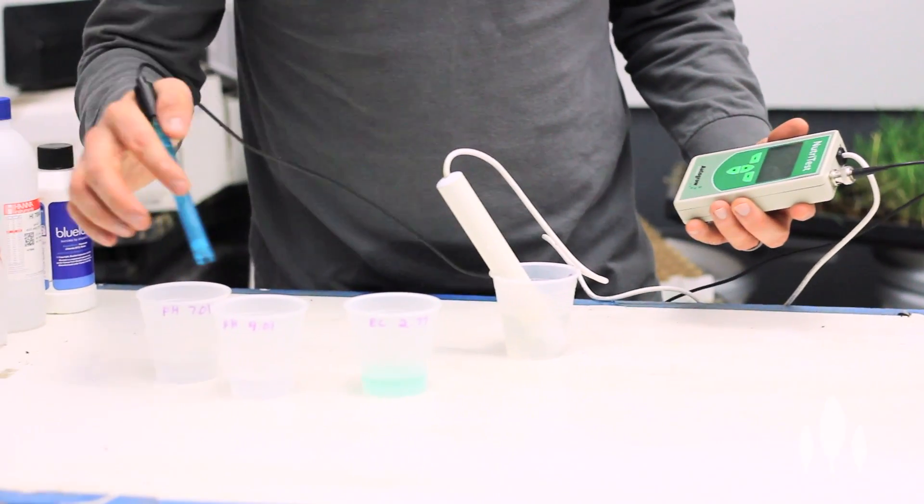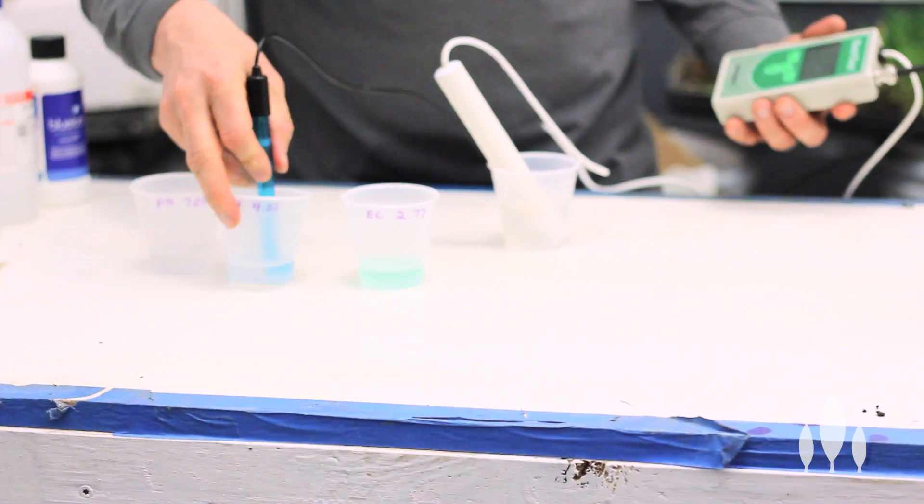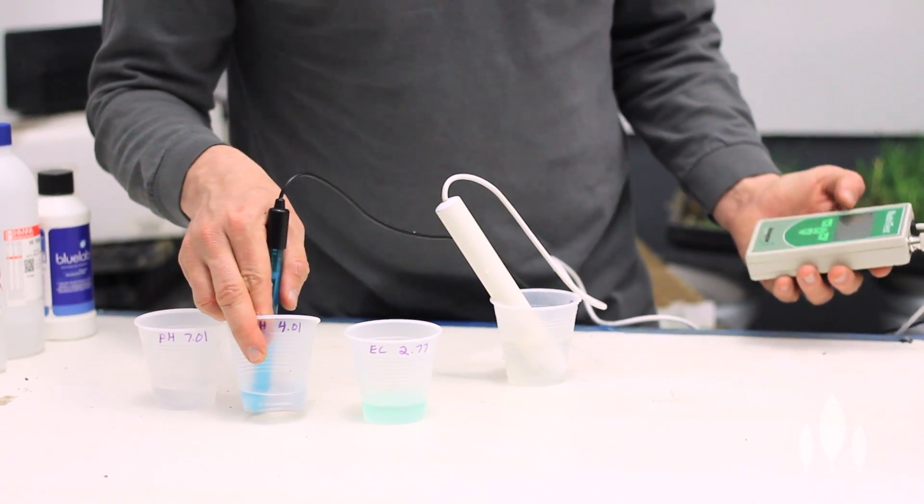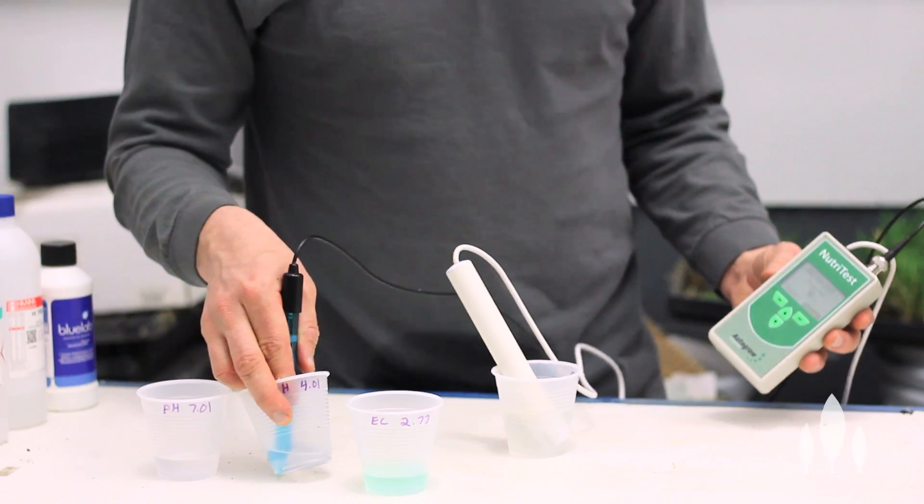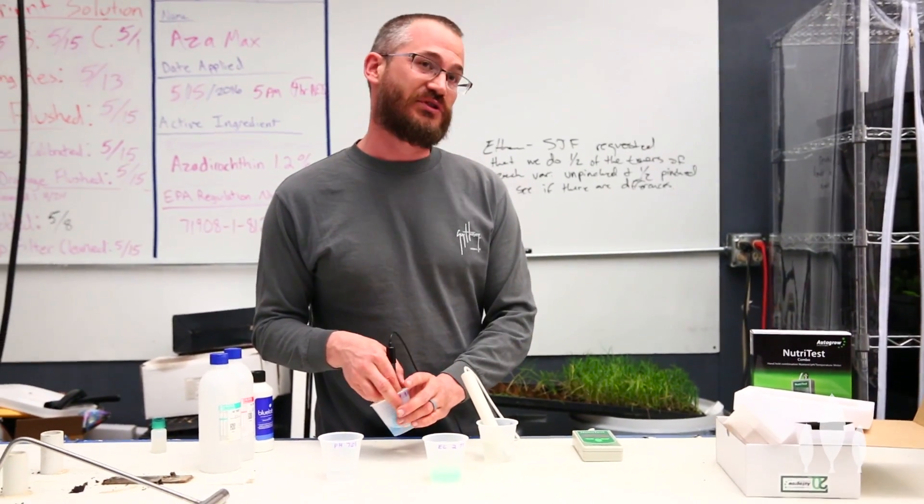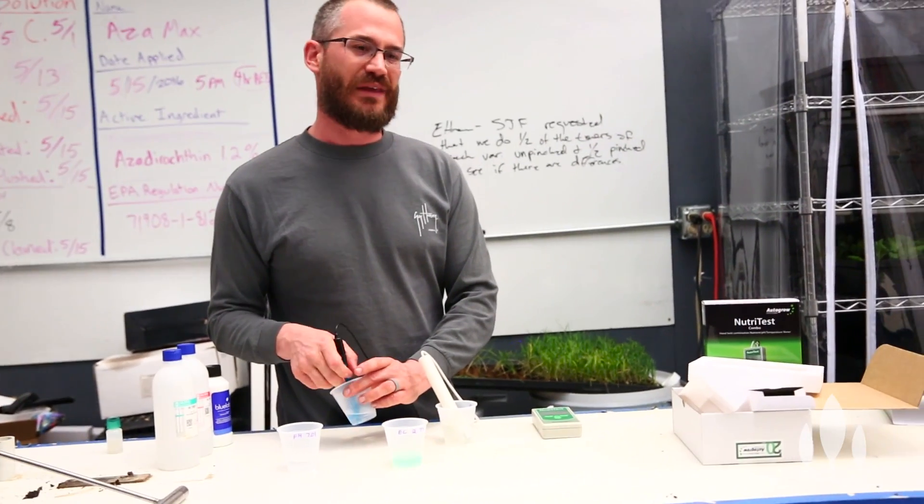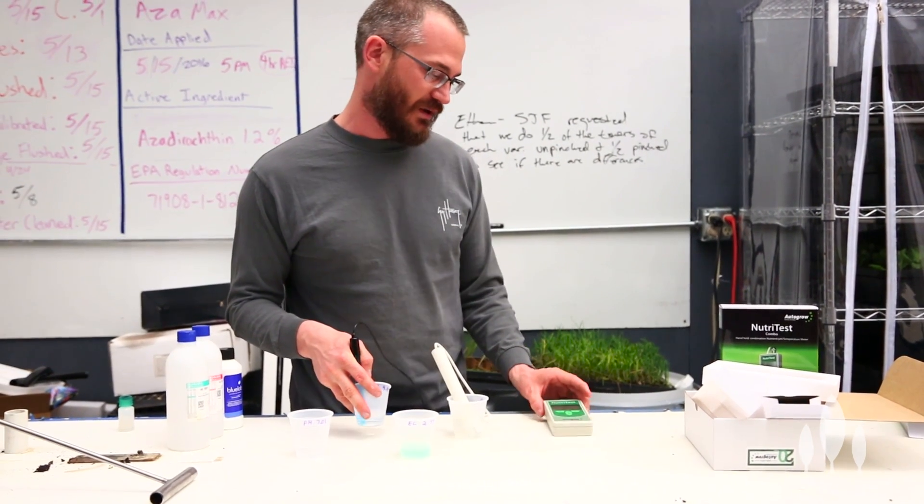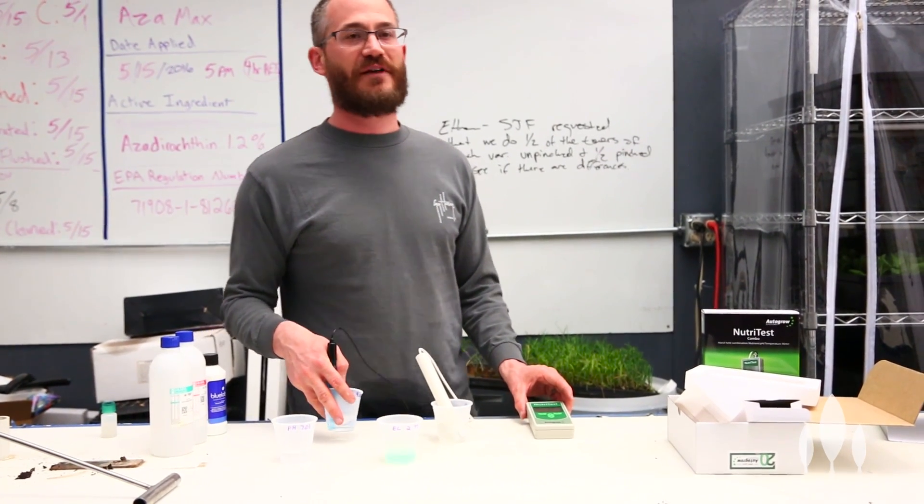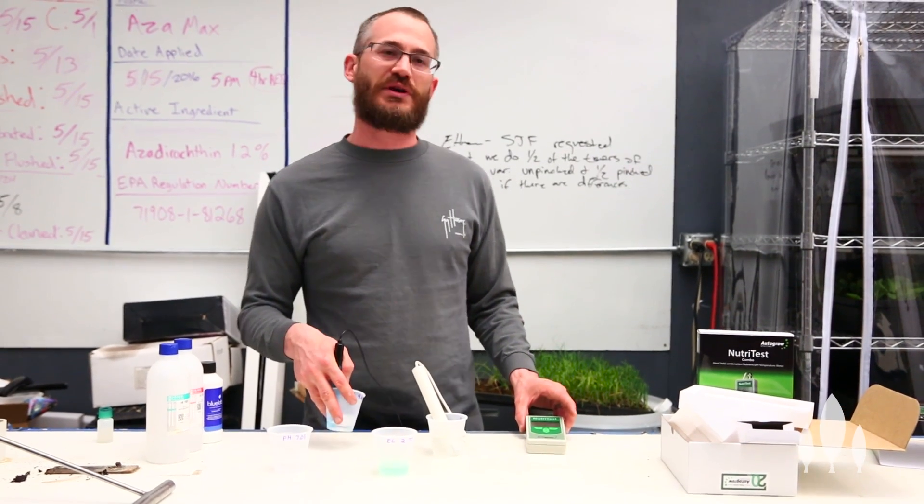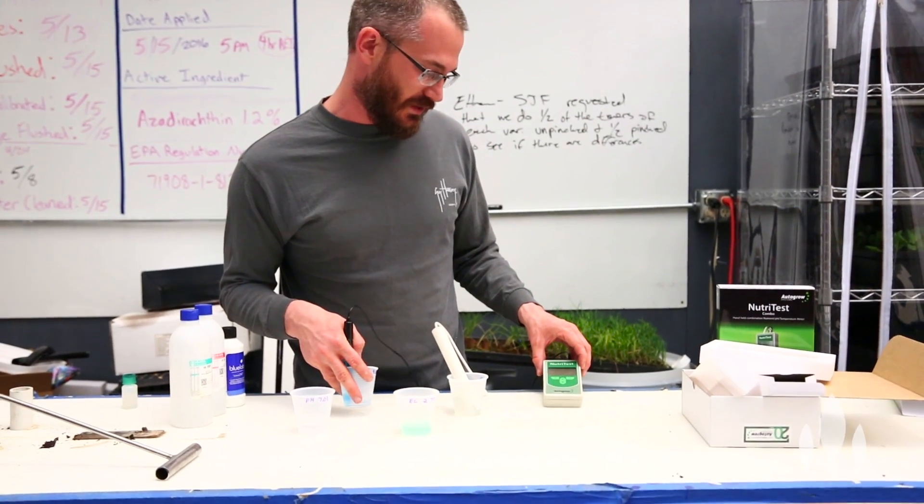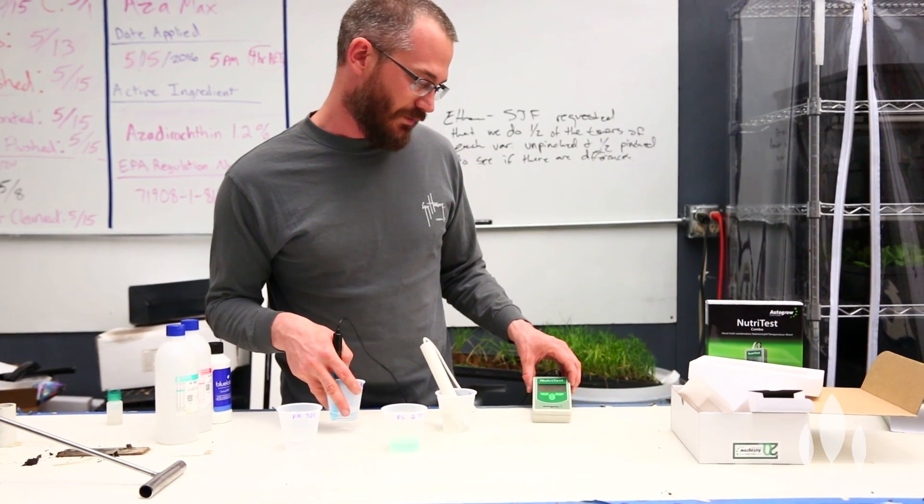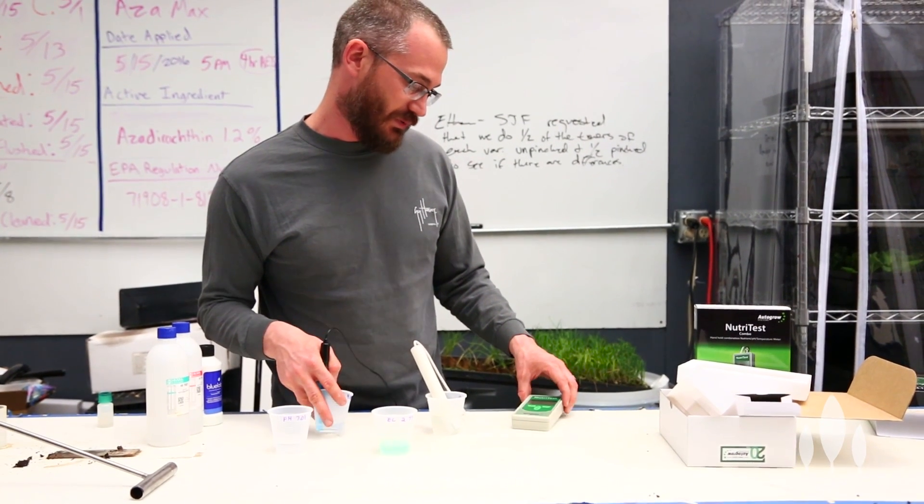And so the idea here is that these probes go off over time. Now place in pH 4 buffer. So we're going to switch it over to pH 4, continue, and it's just going to count down. You will have to buy calibration solution separately. It lasts quite a long time, so you don't actually have to calibrate super often. If you're using the probes a lot, if you're keeping them in solution, then you don't have to calibrate them all the time. But we're almost done here. One. Calibration complete.